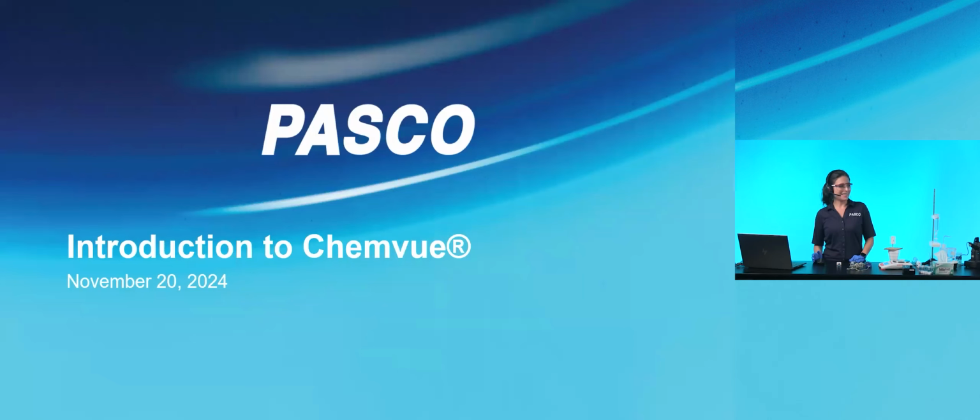My name is Barbara, and I'm here with my colleague Roger, who developed this new Pasco application, the newest in our family of software. It was co-developed by college professors. We got some input along the way. What are the most common data displays and analysis tools that you're looking for?